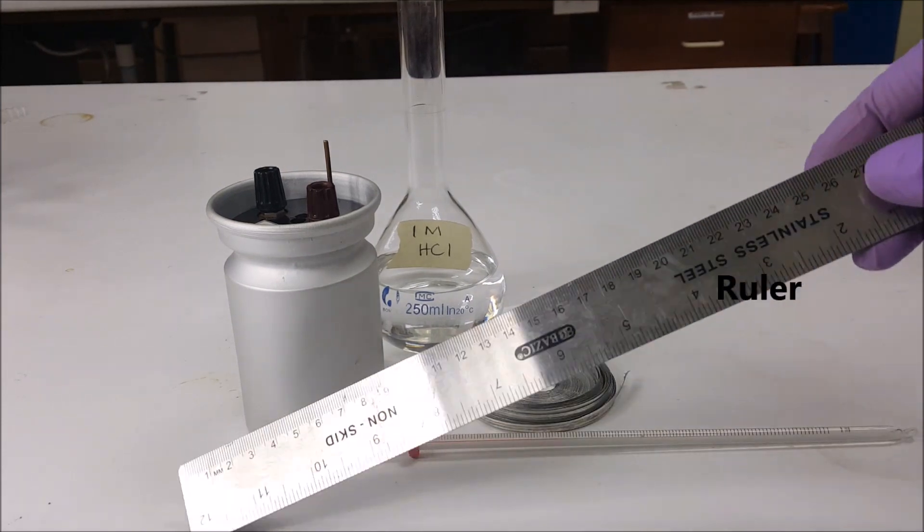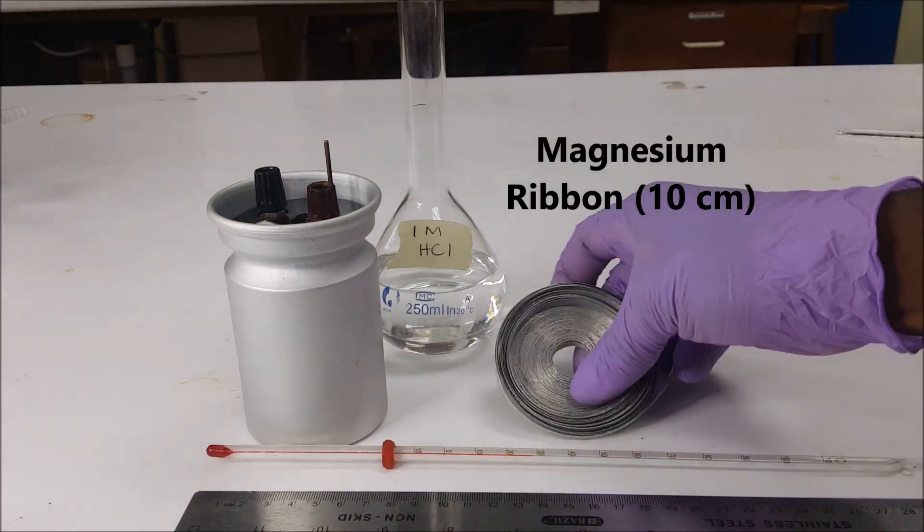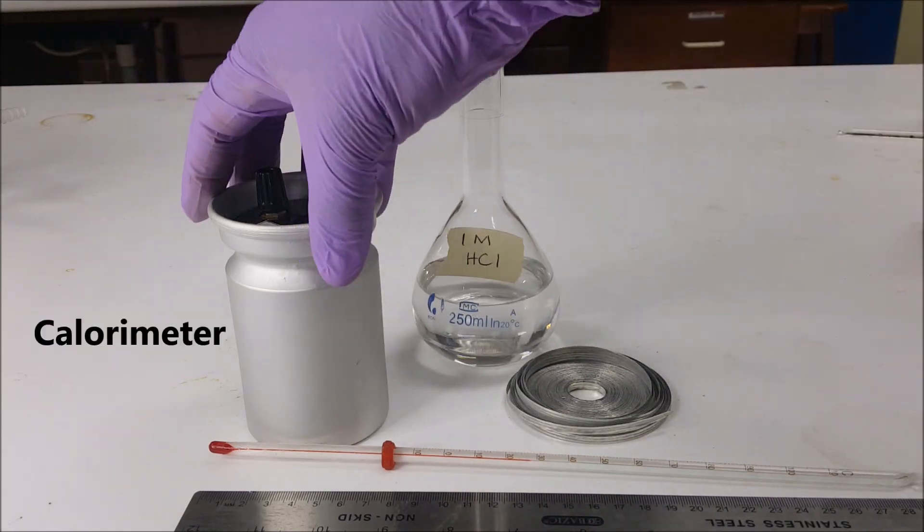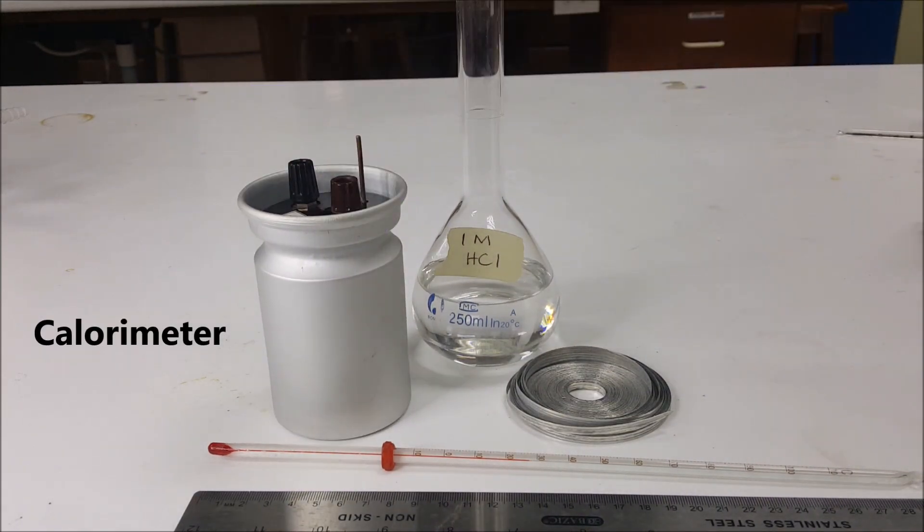This experiment will need a ruler, a thermometer, a magnesium ribbon, one molar HCl solution, and a completed calorimeter.